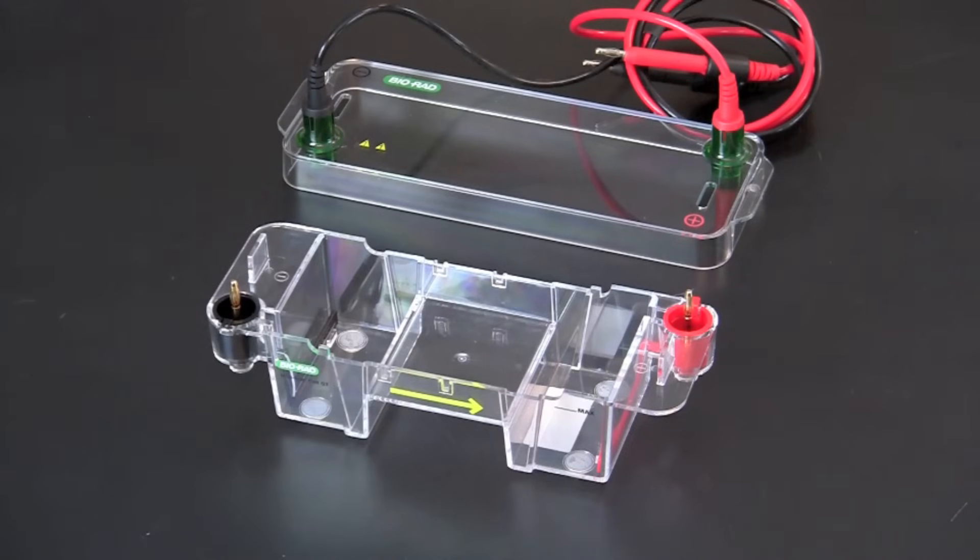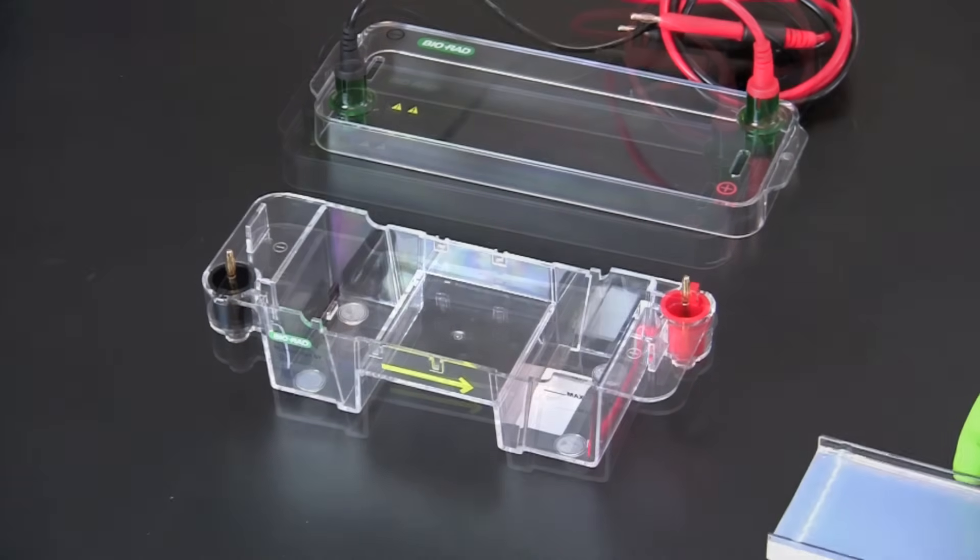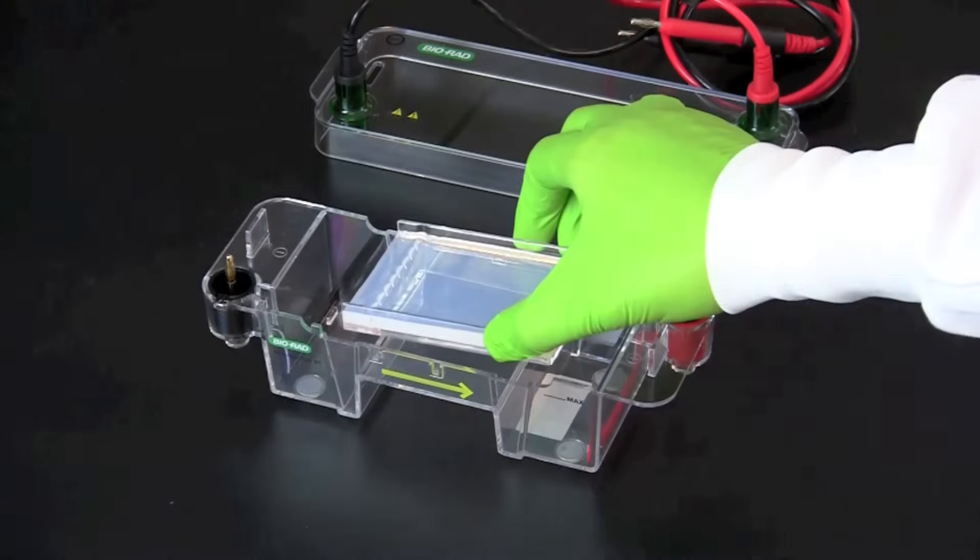First, align the gel so that the wells are closest to the negative or black electrode. DNA is negatively charged and will move from the negative electrode through the gel toward the positive or red electrode. Place the agarose gel into the gel chamber.